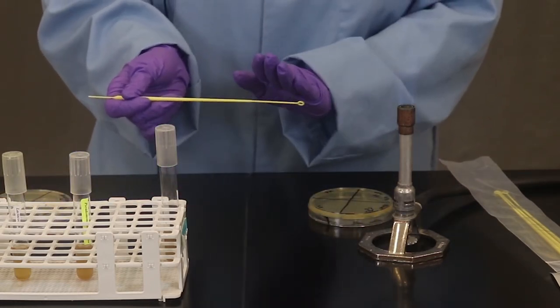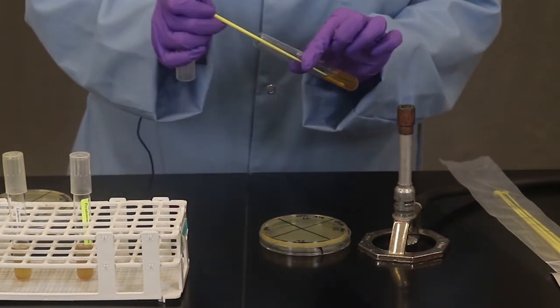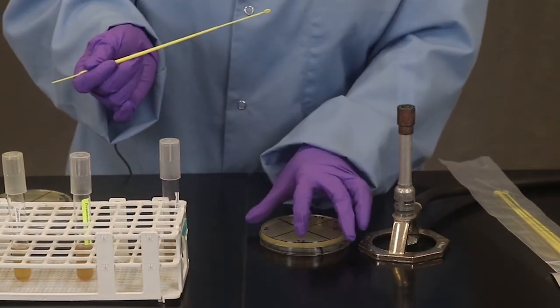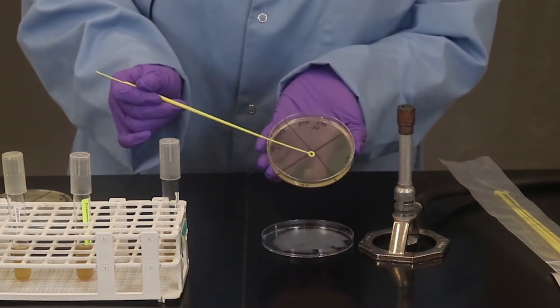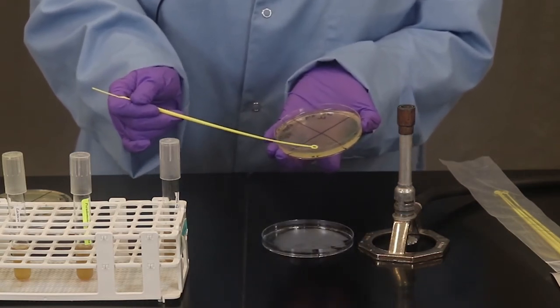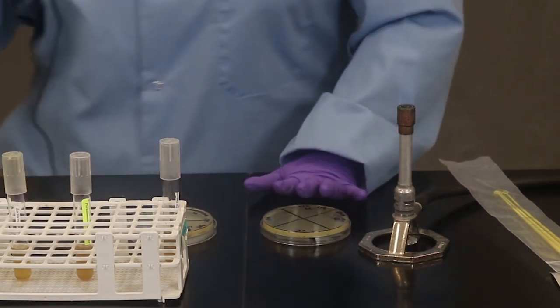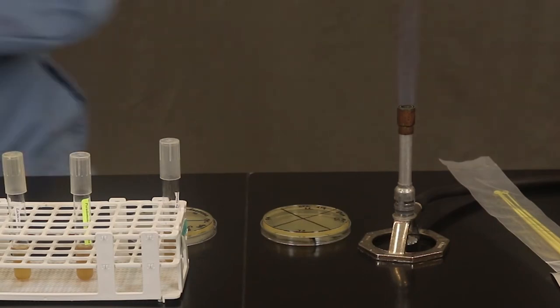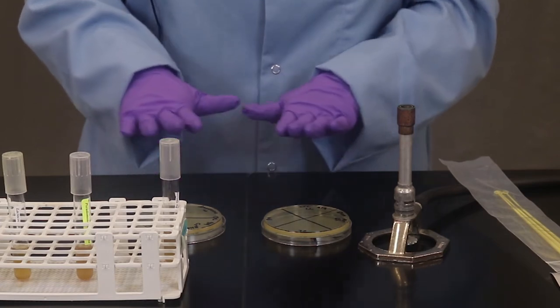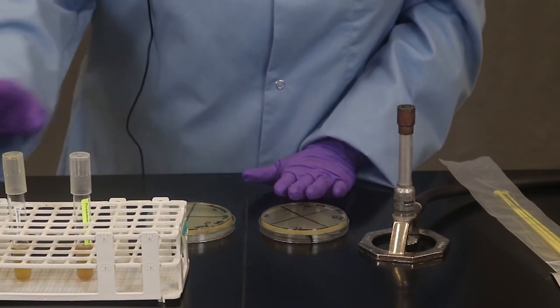That's one petri plate. As long as I don't touch this loop to anything else I'm going to repeat with the second. If you think you've contaminated your loop you need to take a new one. So remember here we're not looking for single colonies. We're not looking to see if it's a pure culture. In this case we're just asking the question can the bacteria grow in an aerobic and/or an anaerobic condition. So we're just looking to see if it can grow.